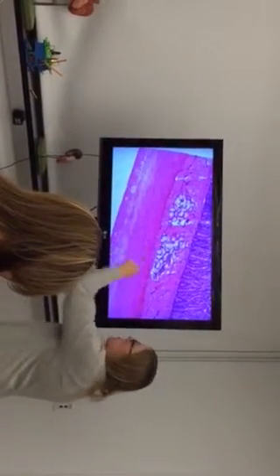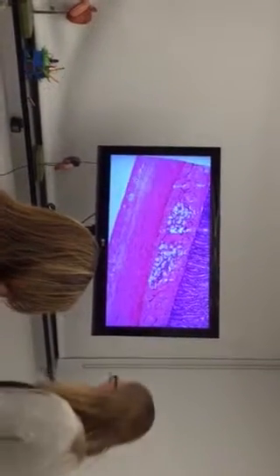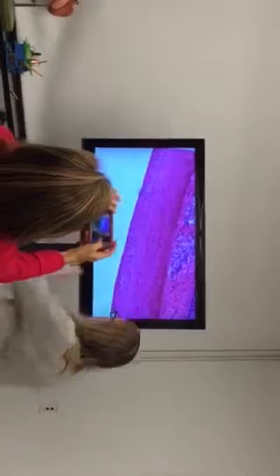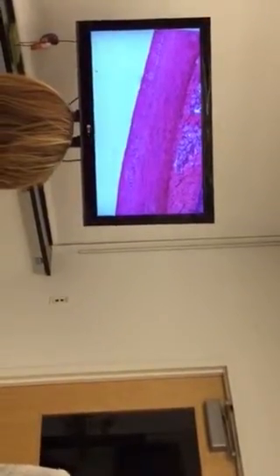And then you have the muscularis externa. Smooth muscle, right? Stacks. That's going to produce the big movements so the food moves along as the enzymes hit it and break it down. And then lastly, serosa, which is really visceral peritoneum. Okay, so that's this area right here. Just to the outside of the muscularis externa. So look for the waves, right? The villi with the small intestine.